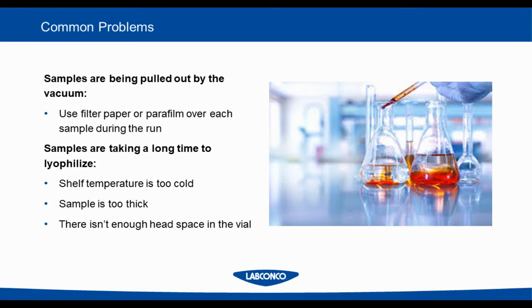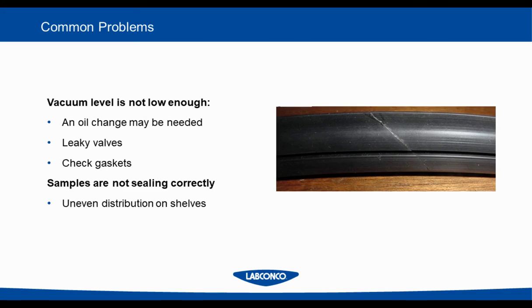Also, make sure you have enough space between the flask and the rubber top. This is especially important if you're putting test tubes inside of a flask. If there's not enough space between the top of the test tube and the rubber top, it will prevent vapor flow.